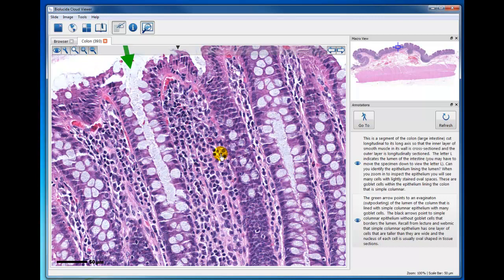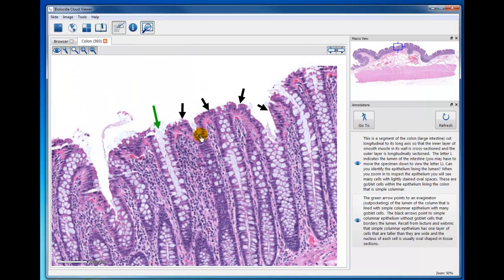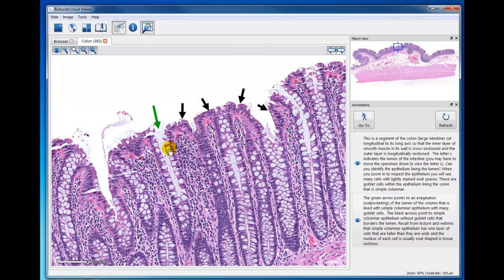But between the epithelial invaginations is connective tissue that is loaded with plasma cells and lymphocytes. And there's even some fibroblasts and smooth muscle cells in here. So we present this in the lecture, in the lab. We don't really say much in the epithelium about, in fact, I don't think we say anything about goblet cells. So I'm really not holding you responsible for that.